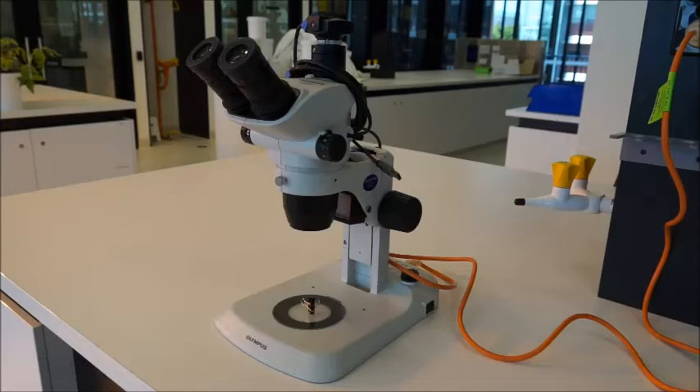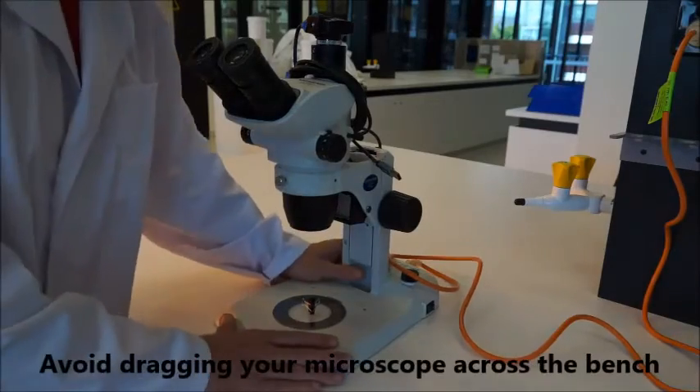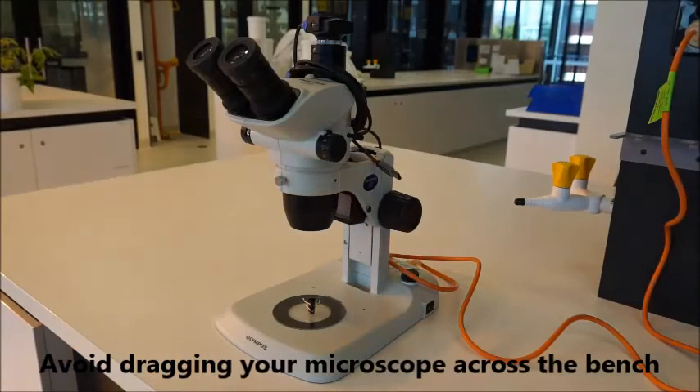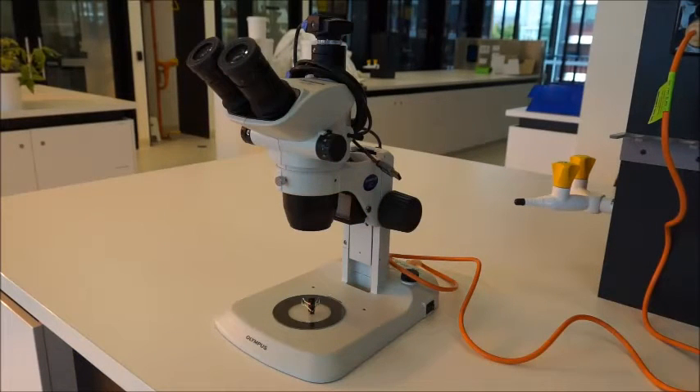It's important to put your microscope nice and close to the power source and to where you're going to be working. Don't try to drag the microscope around because there are rubber stoppers on the bottom and it will shake the instrument and some of the parts may get out of alignment. If you do want to move it, pick it up and actually move it around.